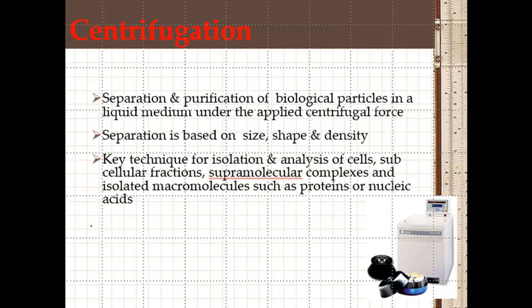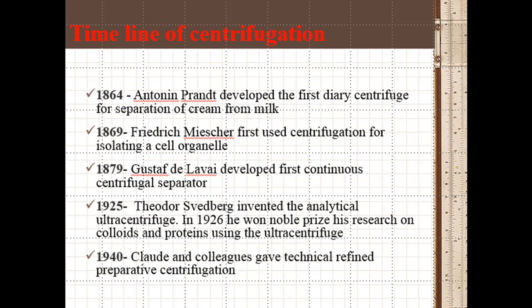Centrifugation is the separation and purification of biological molecules in a liquid medium under an applied centrifugal force. Separation is based on size, shape and density. It is a key technique for the isolation and analysis of cells, subcellular fractions, supramolecular complexes and isolated macromolecules such as proteins and nucleic acids.